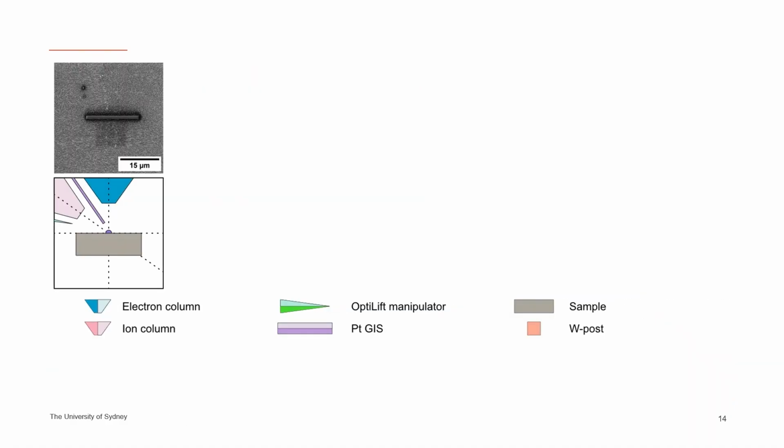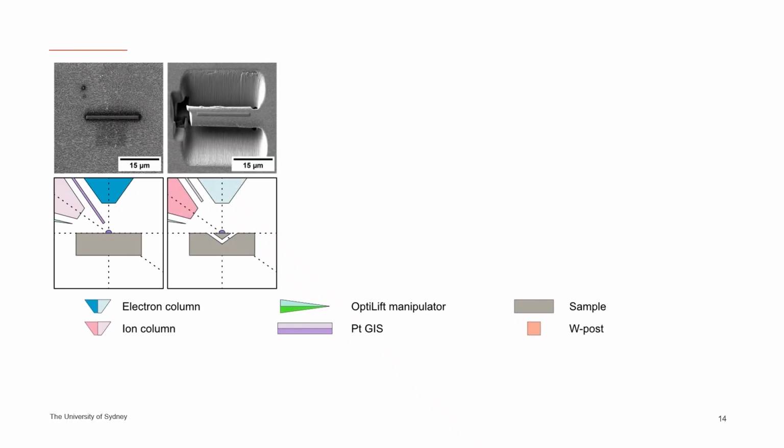Here we would take a somewhat less common approach, to target a region of interest with a known location relative to melt pool interior and melt pool boundary. As you can see in the top left micrograph, I would only mark the region of interest using electron beam platinum deposition and skipped the reinforcement with a low voltage ion beam. The undercutting was also performed at no stage tilt, producing a much more shallow wedge, as you can see in the second row.